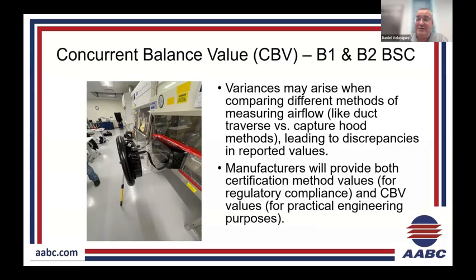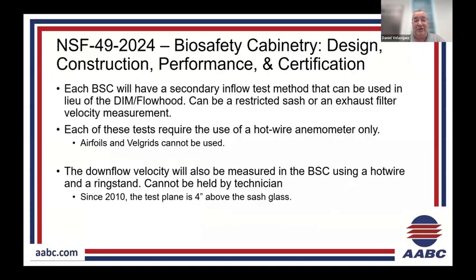You hear about back pressure compensation. Some firms use it, some firms don't. When you're using a bio cabinet, they say not to do back pressure compensation when you're doing the exhaust flow. Some manufacturers say it, but NSF will ask you otherwise.